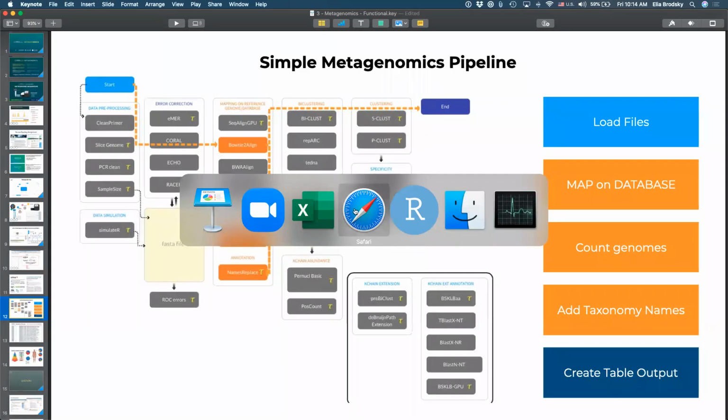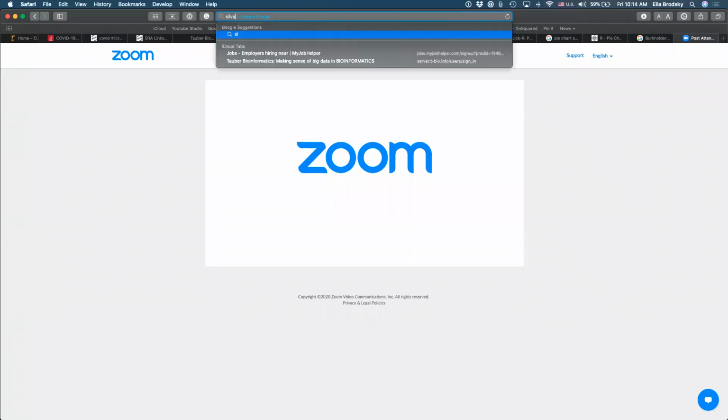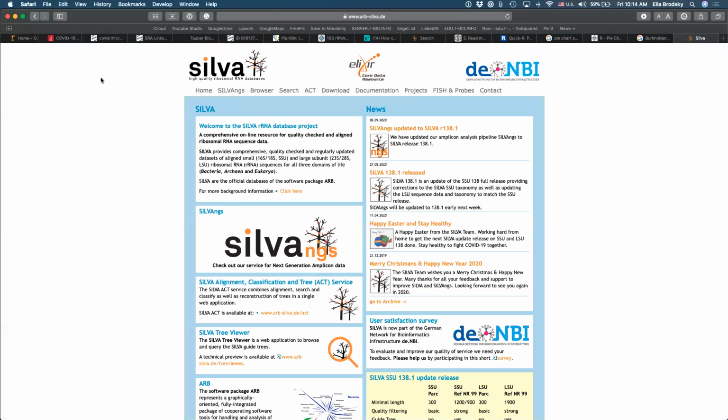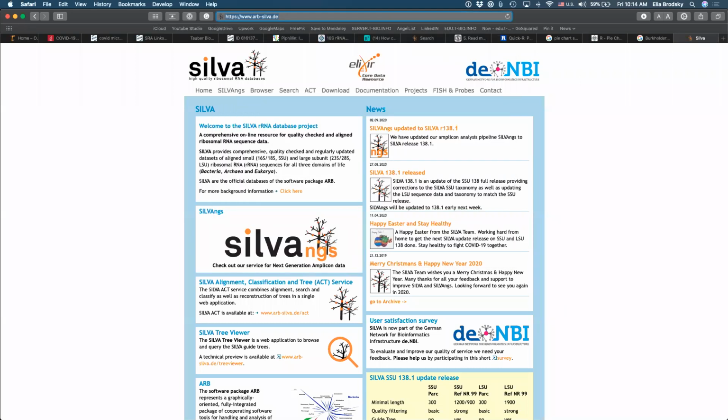To get to Silva, we have to go to Silva. So this is the link. Okay, so please navigate to the Silva database. And let me know once you're there.